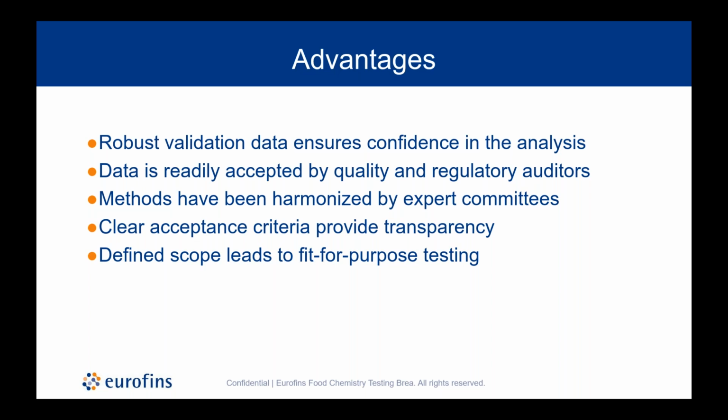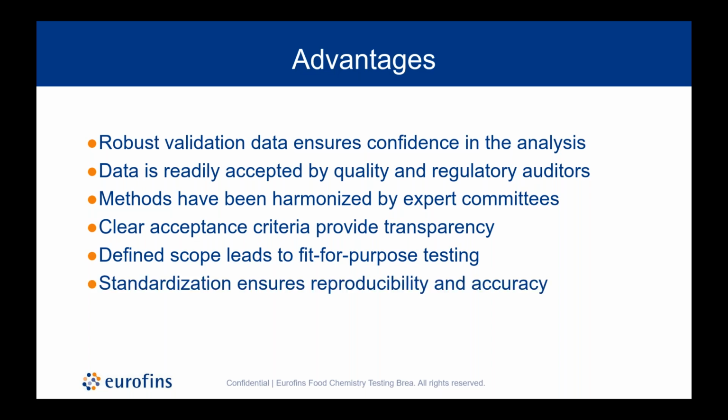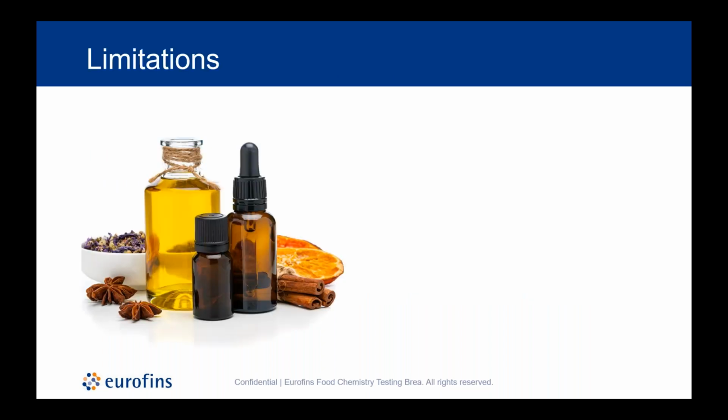So the scope of the method, which we highlighted, is a way to ensure that there's fit for purpose testing performed on every sample and that the material that we are testing is the intended use of the method that it has been validated for. And lastly, the standardization that comes with a pharmacopoeial method ensures that from day to day, from different analysts, the results will be reproducible and accurate according to the criteria and validation of that method.